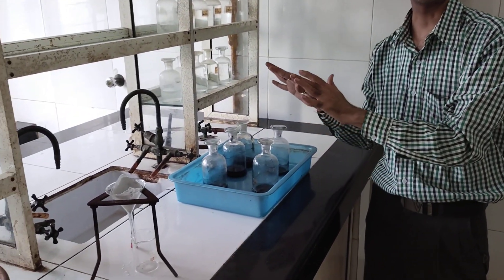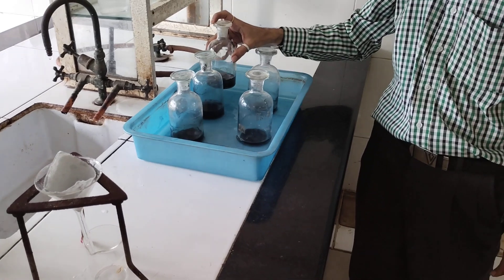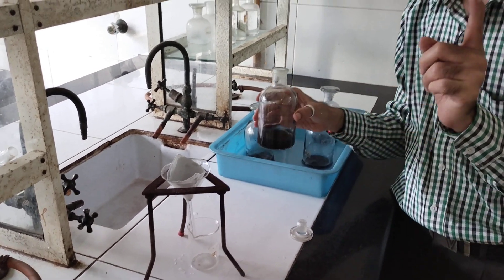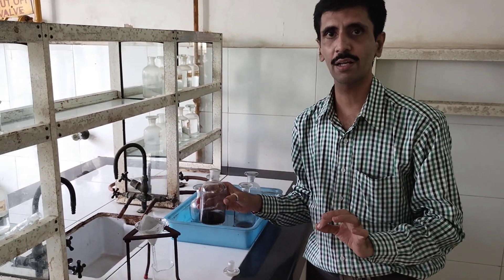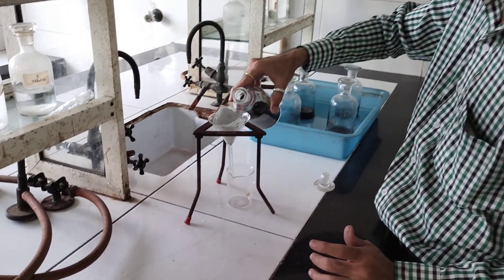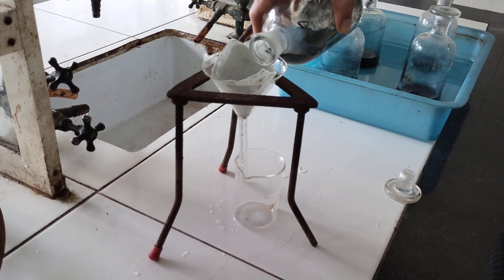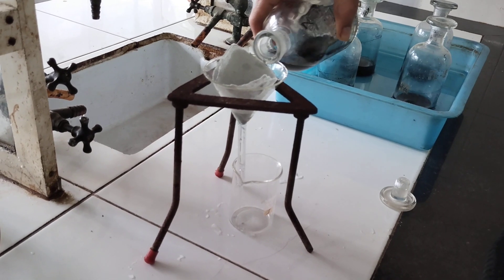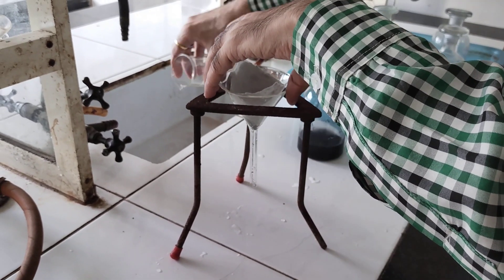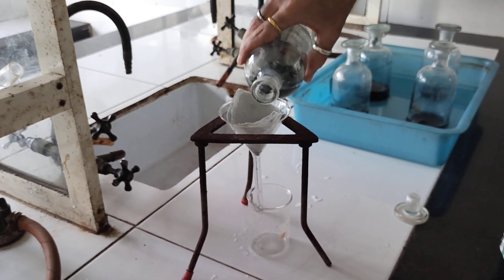It is now half an hour. In between I have shaken the solutions. We will take the first bottle — bottle number 1. Now what we are going to do is filter the contents. As I told you in the theoretical part, when you start with the filtration, the first three to four drops have to be rejected. So we start very slowly with the filtration and those first three to four drops I am going to reject.